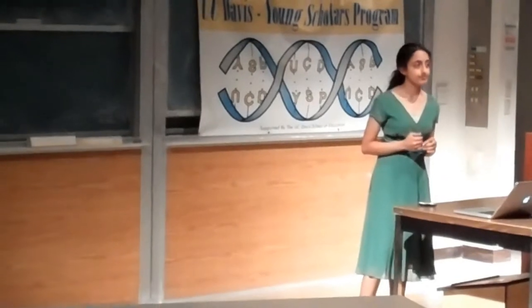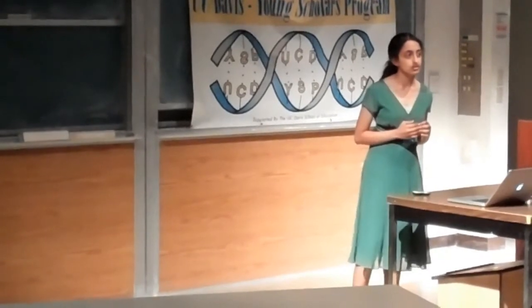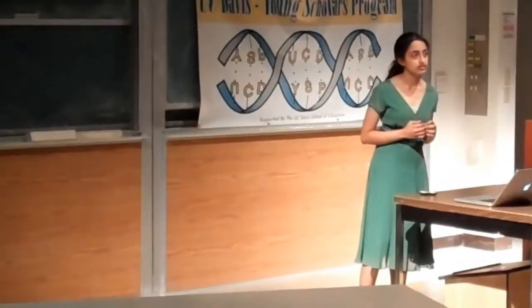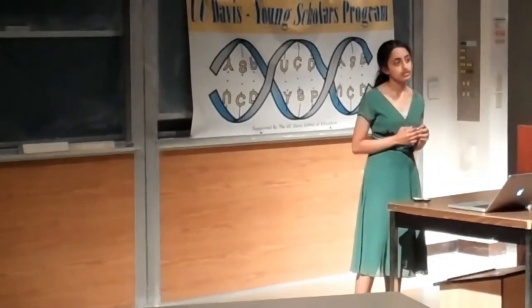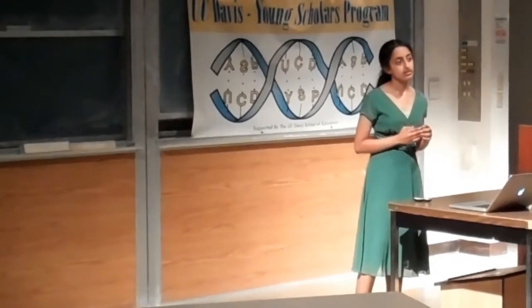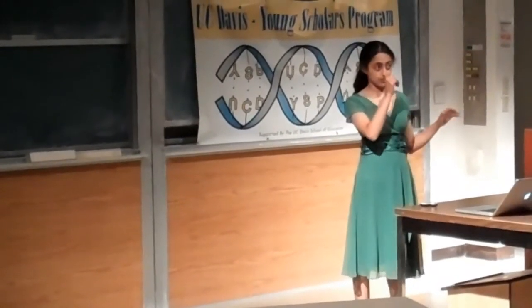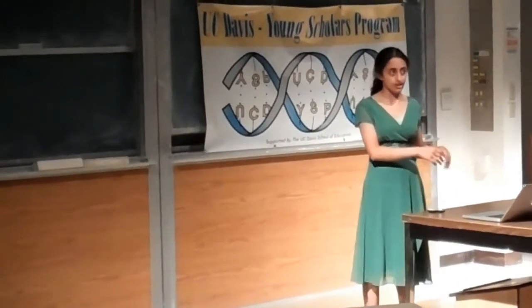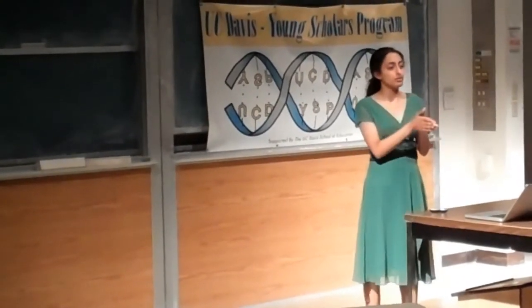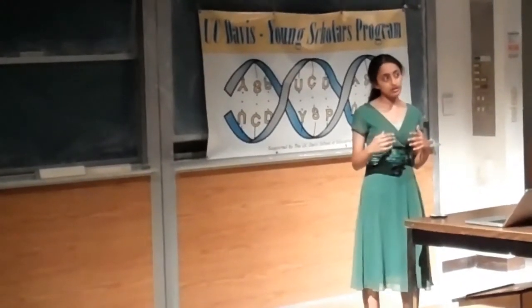William? Is the DNA solely just so you can knock out that gene? Could you repeat that again? Well, in part of it, you said that just the DNA would knock out the gene. Yeah, sequence, but was there any other reason you did that? Like, I think I saw it, but I'm not sure if you said like application in PCR. Okay. Well, that's sort of separate. What we're doing in transformation is we're creating artificial microRNA lines, which is something totally different. But what I was doing when I was isolating DNA was I was taking samples that we got from a database, which are mutant lines, which have tDNA insertions.